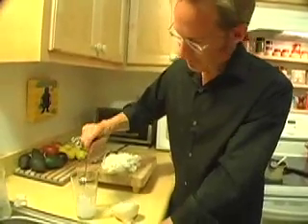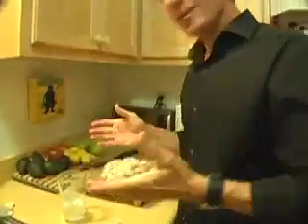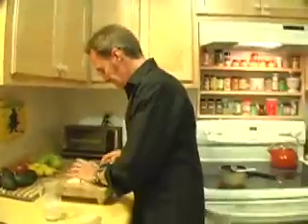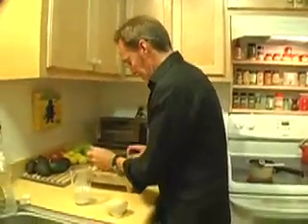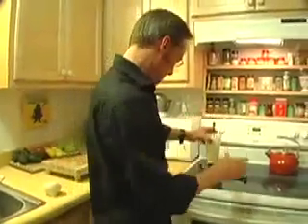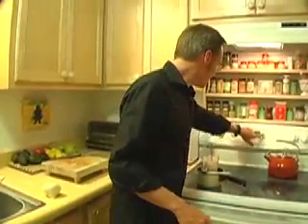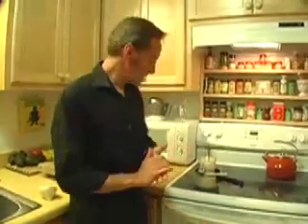Let's put the onions in the soapy salt water. You're going to want to heat this for about 10 minutes.